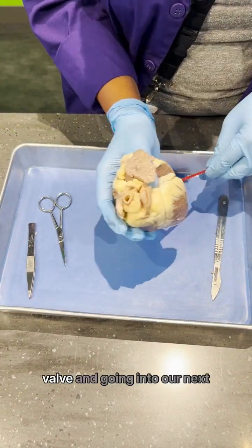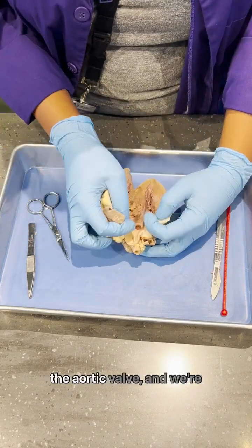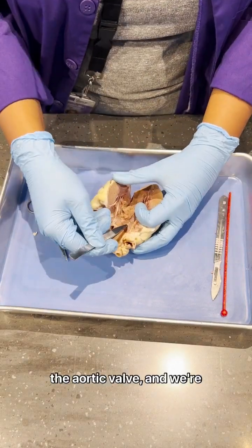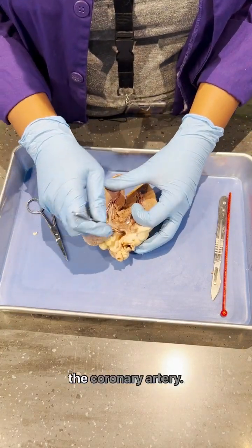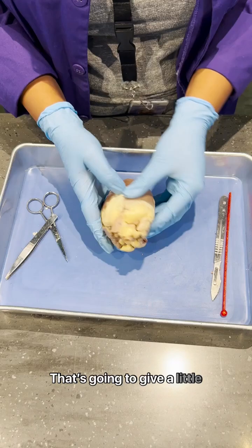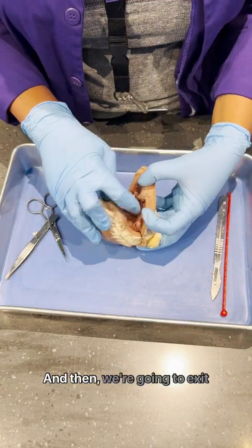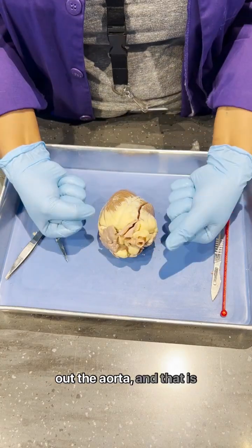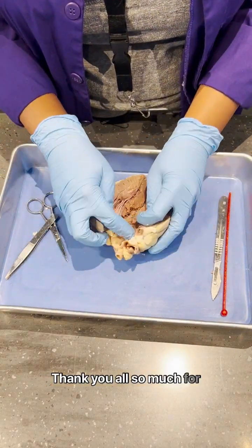We're passing the mitral valve and going into our next section, the left ventricle. Then we're going to exit out the aortic valve and we're going to see that in front of it there's a little hole which is the coronary artery. That's going to give a little bit of extra blood to our heart so that our heart has oxygen and nutrients, and then we're going to exit out the aorta. And that is the path of blood throughout the heart. Thank you all so much for watching.